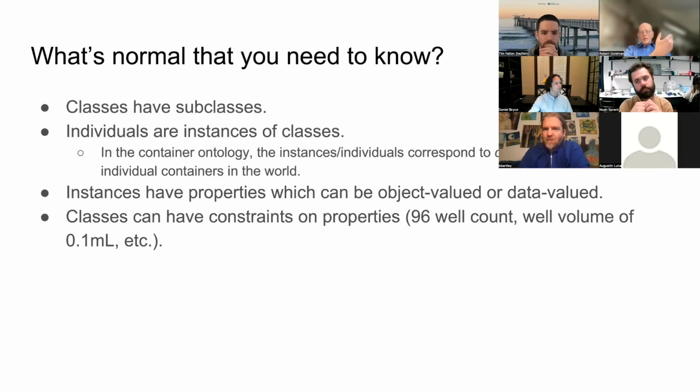So here, you can sort of think of the individuals as catalog entries, or if you want to think of them that way, they're like prototypes. So in PAML, you'll mostly want to point to one of these things rather than, you won't want an instance of these things.